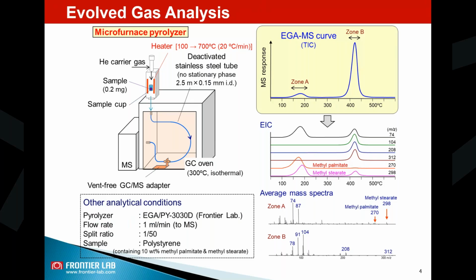We are constantly looking at the compounds that are evaporated during this thermal treatment. And we use a full scan range. That means we collect the compounds in the mass range of 39 to 500. So from this TIC, the total ion chromatogram, we can look for specific information by getting this extracted ion chromatogram and also the associated average mass spectra.